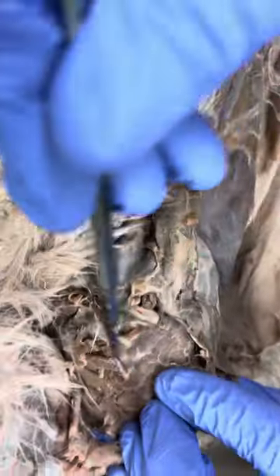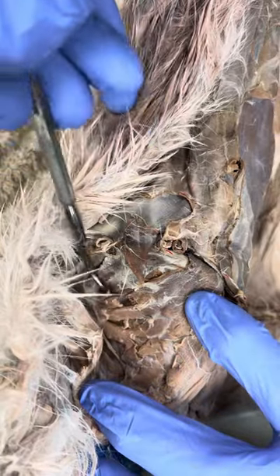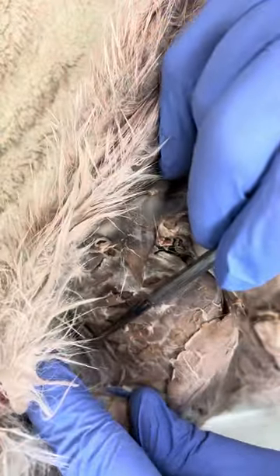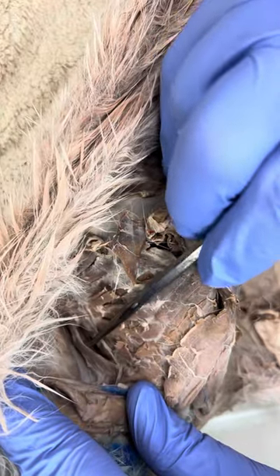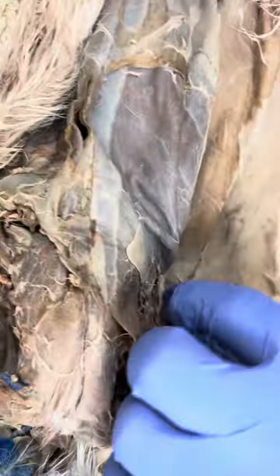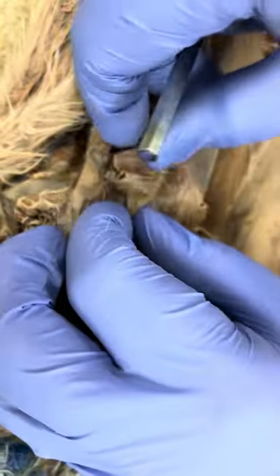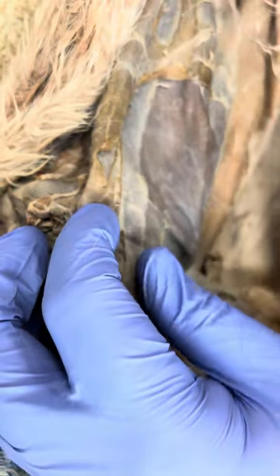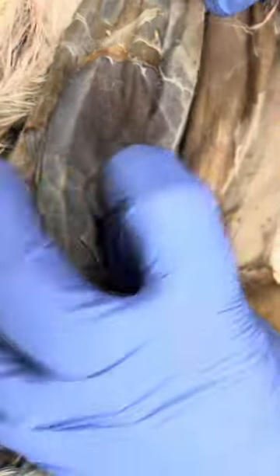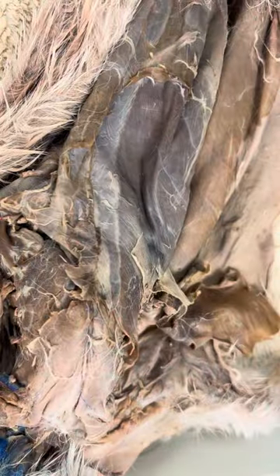So once again, we have the serratus muscles up here. Our rhomboid is going to be down in here — and again, if you can't see that very well, we'll see it more when we get to the back. Latissimus dorsi, my external oblique — which is actually kind of torn off right now — is what's covering this up. I remove that external oblique and expose the rectus abdominis, my transverse abdominis, and then my internal oblique down in here. Thank you so much for watching.